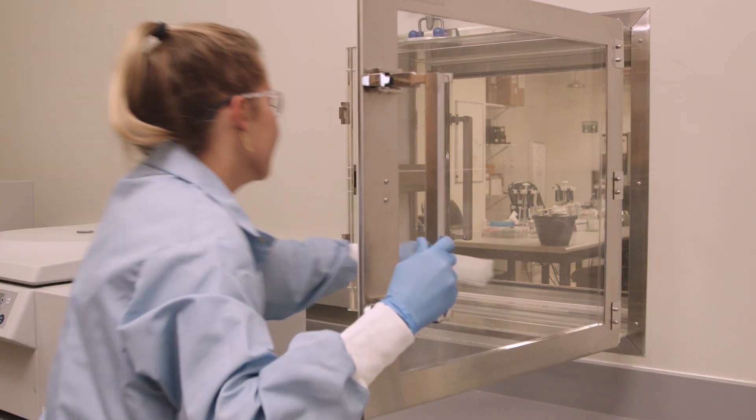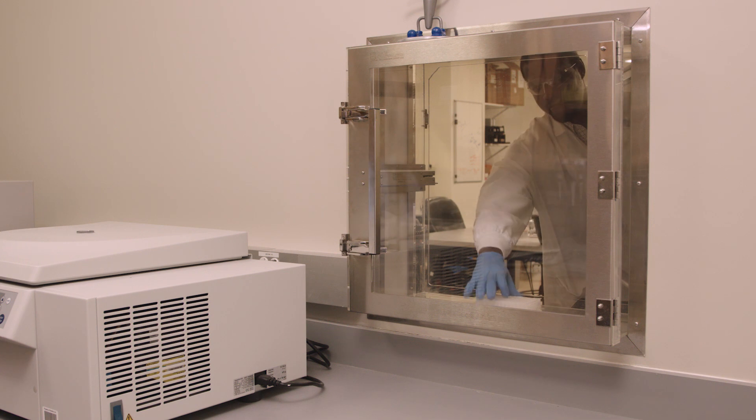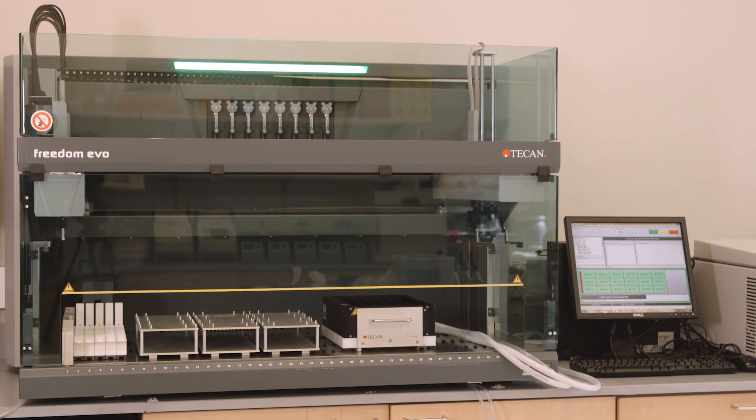Many new to Infinium laboratories may have a number of questions regarding the required equipment and setup of their labs. To help with this, Illumina offers a convenient starter kit that includes some of the components needed to run the Infinium workflow. Although the items can be purchased separately, this kit provides an easy, streamlined start for new users. As for lab setup, we recommend that you carry out pre- and post-amplification steps in separate laboratory areas. If you're automating, your post-amplification lab will require a TCAN robot to perform the liquid handling steps.